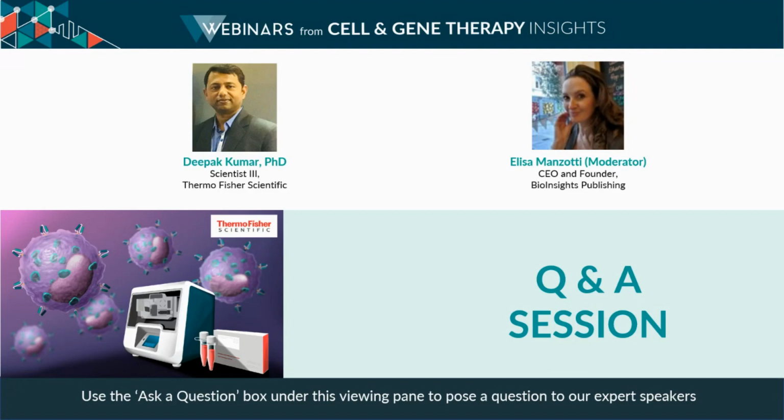Okay. Thank you so much. For the first, we optimize on a smaller scale, using the Neon system. During optimization, we have to focus on the electroporation protocol, especially voltage, and as we mentioned, how different voltages behave in different cell types. Other variables to consider during optimization are the electroporation program, cell density, payload concentration, and starting material.